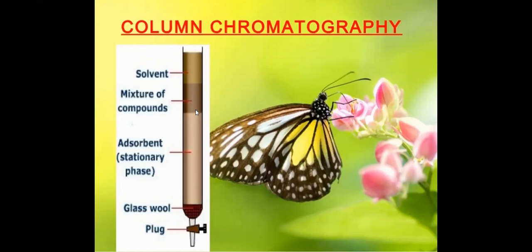That means pour the solvent through the glass column on the top side and remove it in small fractions through the column plug. One more thing in designing the column packing: insert a small glass wool in the bottom side of the glass column, or simply we can use a cotton plug, just to protect the adsorbent layer.